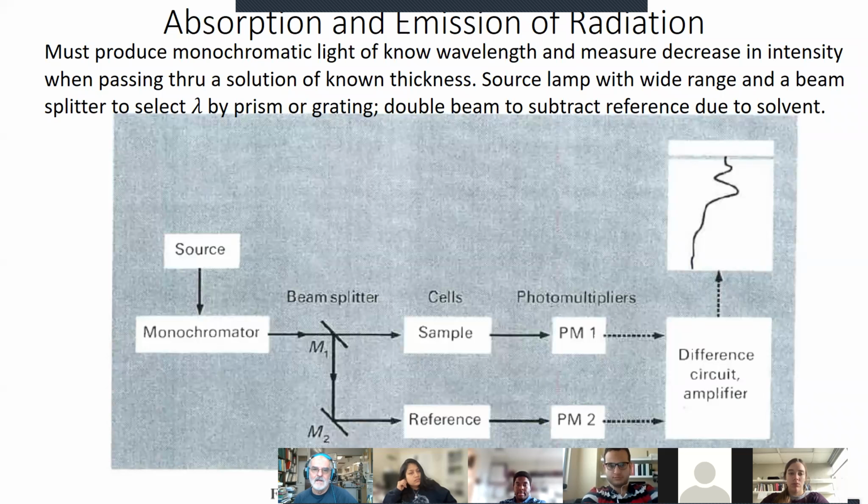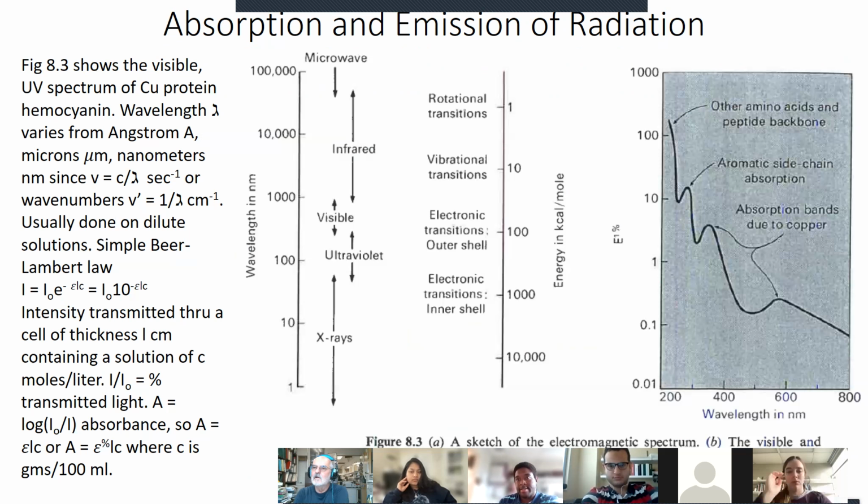Dr. Correa, yes. I'm sorry, I just have a quick question for the spectra on the previous slide. How do you know that the absorption that you see for copper is copper and maybe not another?